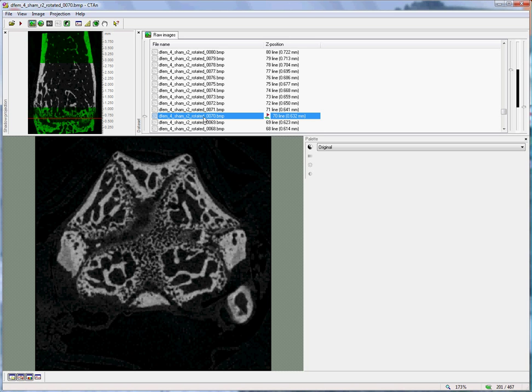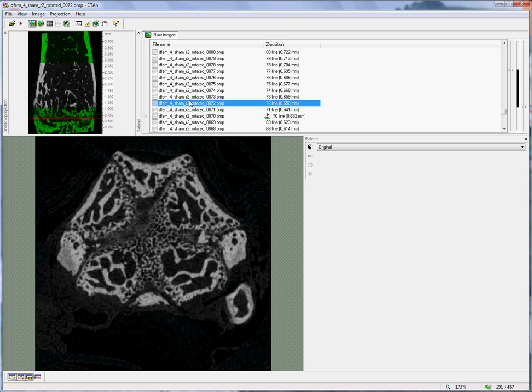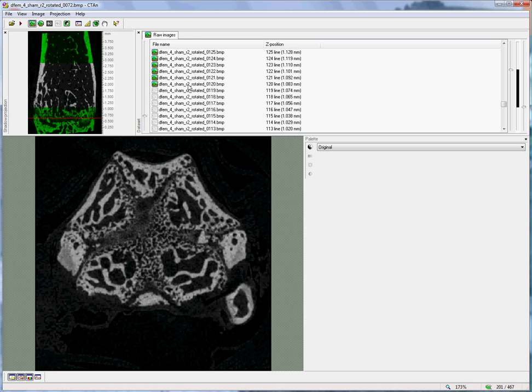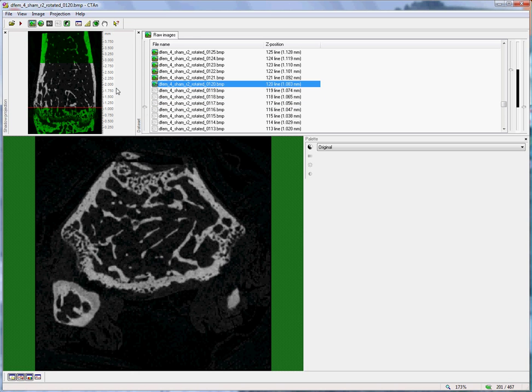Now what this does is allows me to automatically set a vertical range of slices which we will analyze for trabecular bone. So, beginning at slice 70, if I move up, I find that at slice 120 is the beginning of the region of interest.